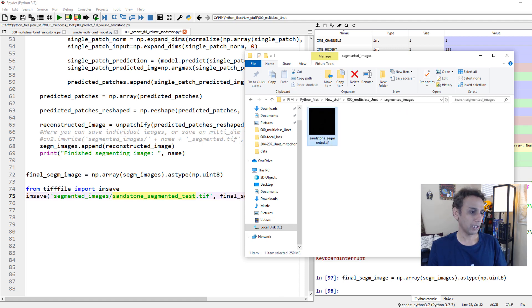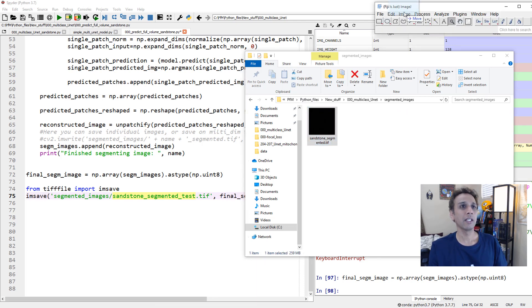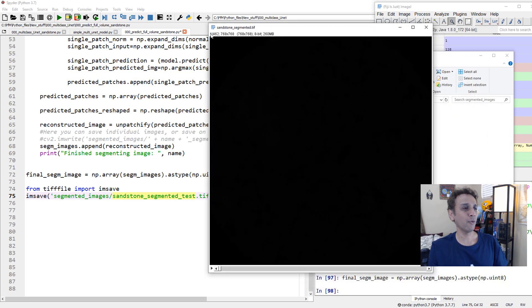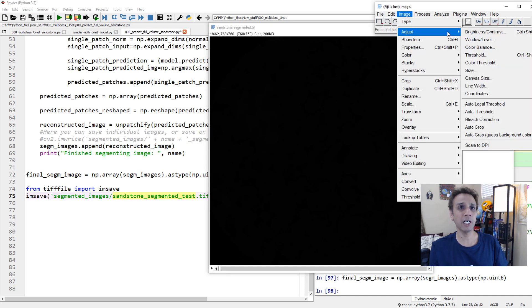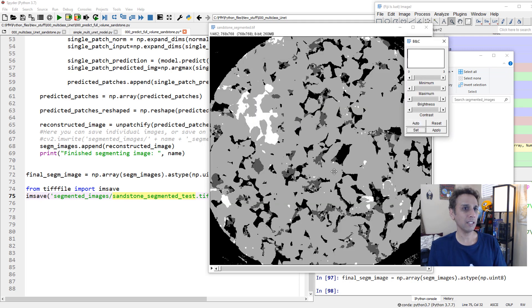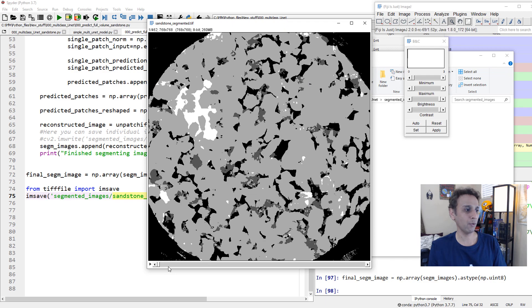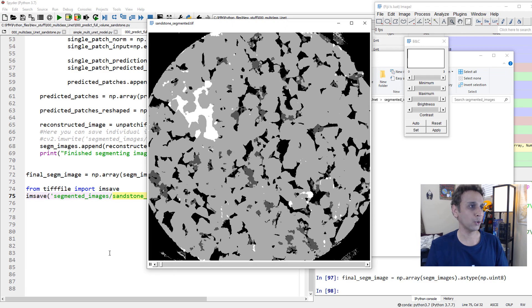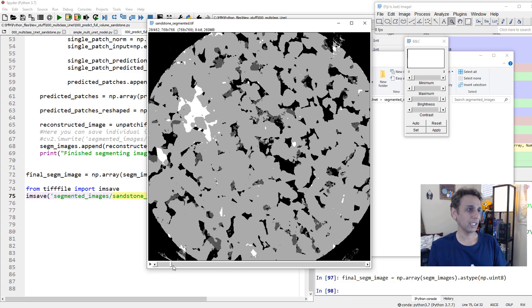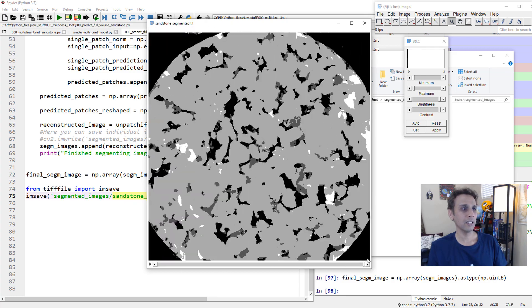Opening the single TIFF file in ImageJ, you can see it has 462 slices each 768 by 768. Adjusting the brightness and contrast to the range 0 to 3, you can see the segmented volume. Playing through the slices or scrolling manually, you can see each segmented slice.